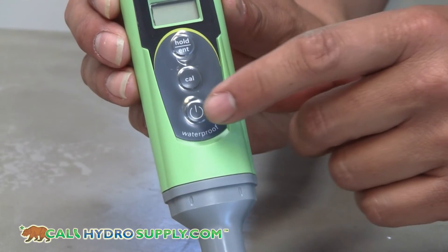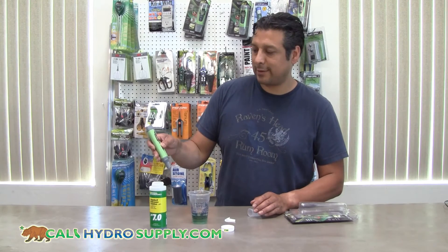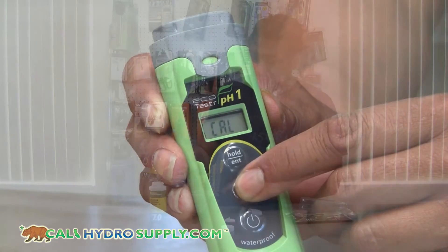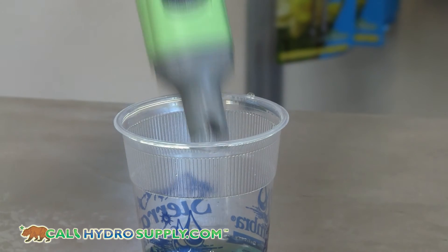Take the cap off. Turn on the meter and immediately hold down the calibration button. Once it starts to blink, you submerge it into the solution and wait for it to reach 7.0.